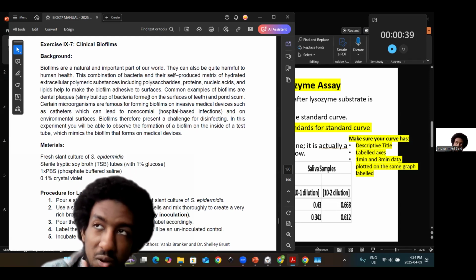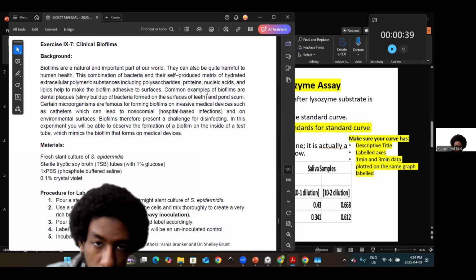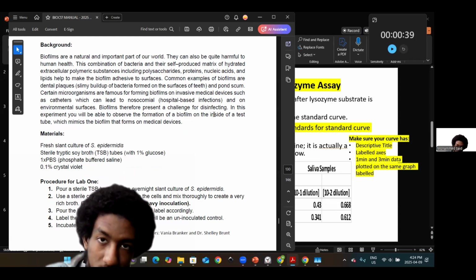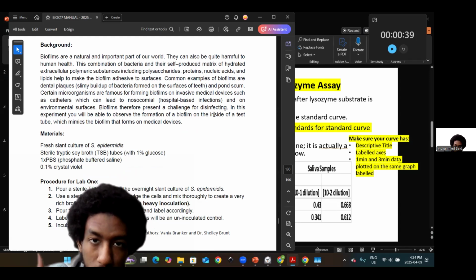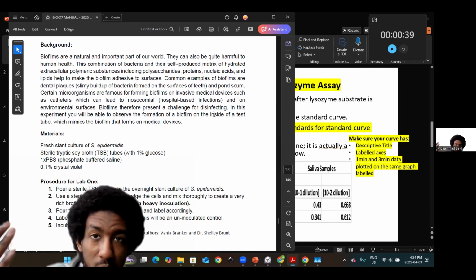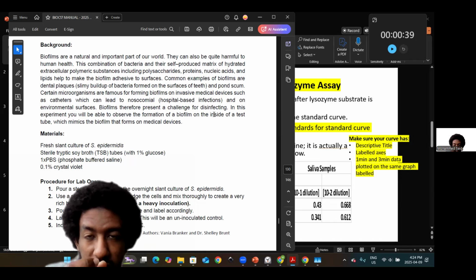Lactobacilli connects us, or like with the Snyder test, or with our other, even our plates, right? Because on the plates, the bacteria are growing. With the media, they're able to essentially absorb, take up nutrients, and release exoenzymes, like the DNase, or release certain waste products. And so if you accumulated those plates over multiple weeks, not just for a specific time point or even 24 hours overnight, you can imagine a huge mass of cells.